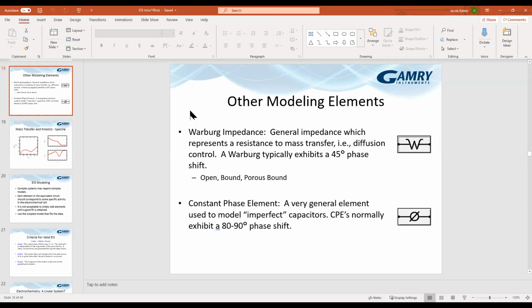If the white lead is connected to a reference electrode that you forget to put into the same electrolyte, or if it's left hanging, or basically not connected at all, then there's no voltage sensing. And so when you try to run a measurement, it keeps measuring that nothing's changing, and it's going to drive more and more and more current through it. So for some systems, for some electrodes, that might be problematic. So you need to have all of your leads connected, but that's not going to damage the potentiostat.